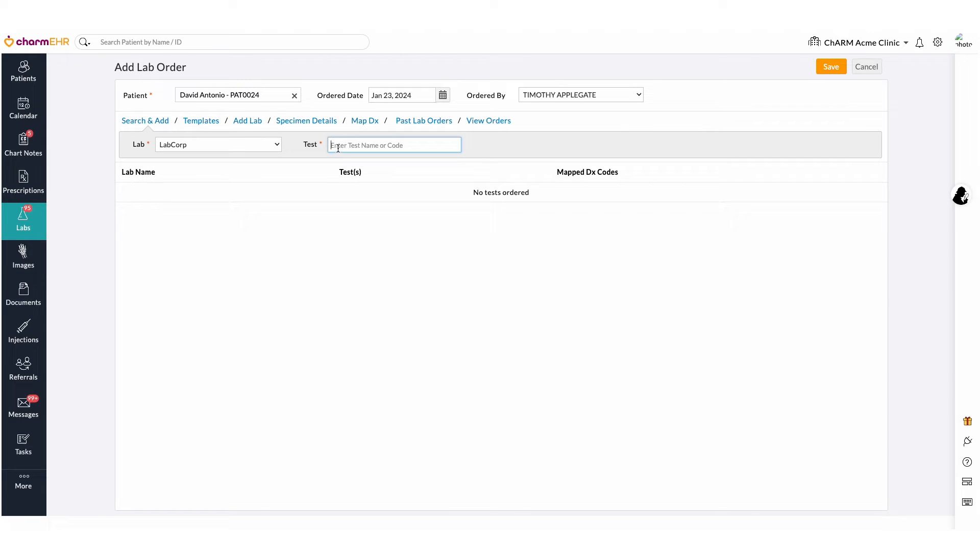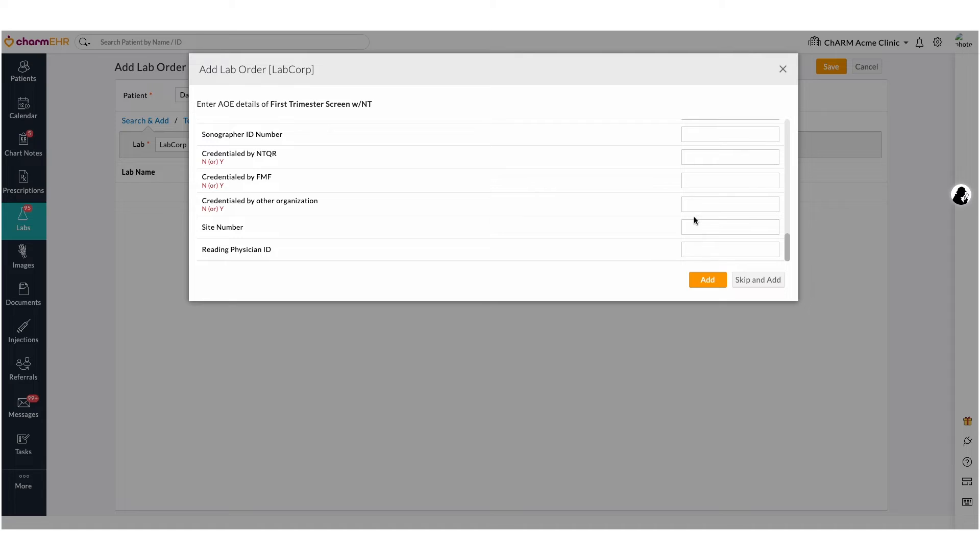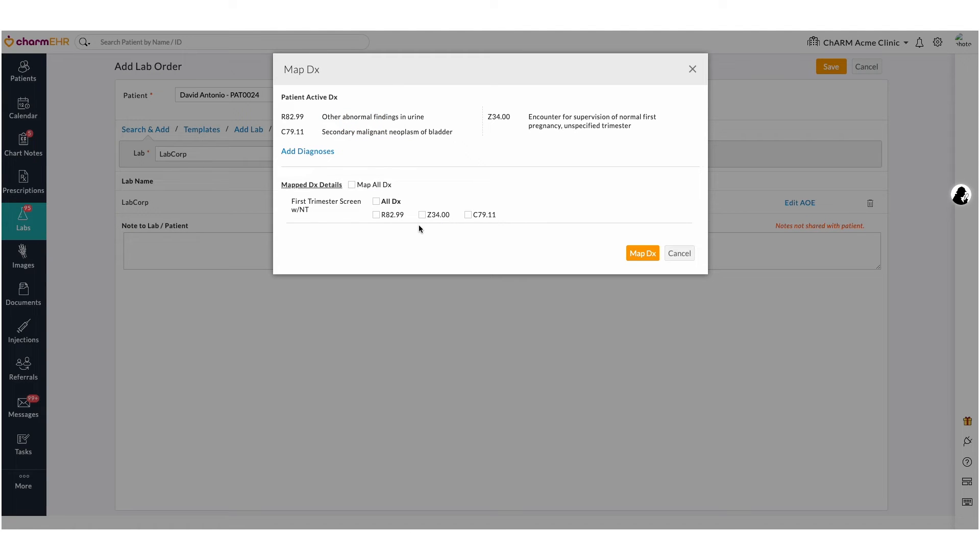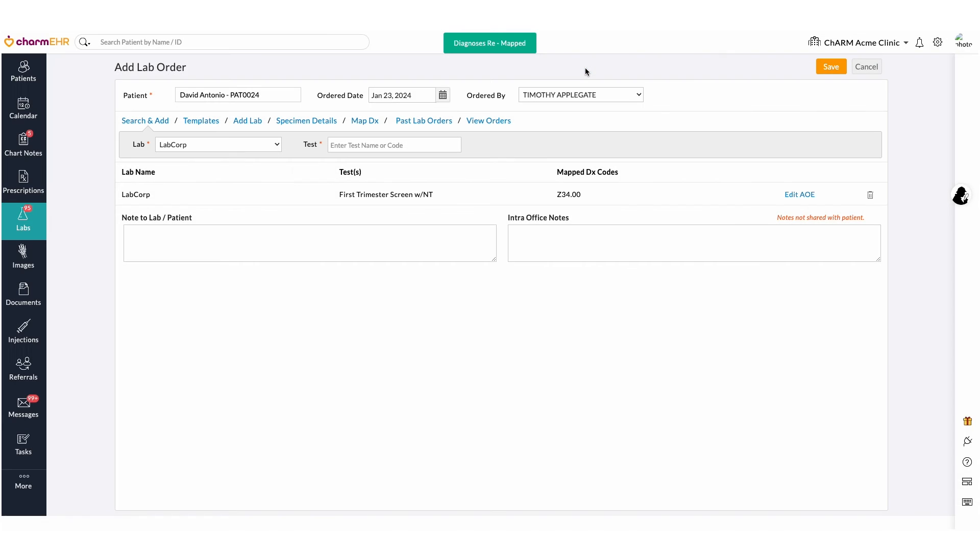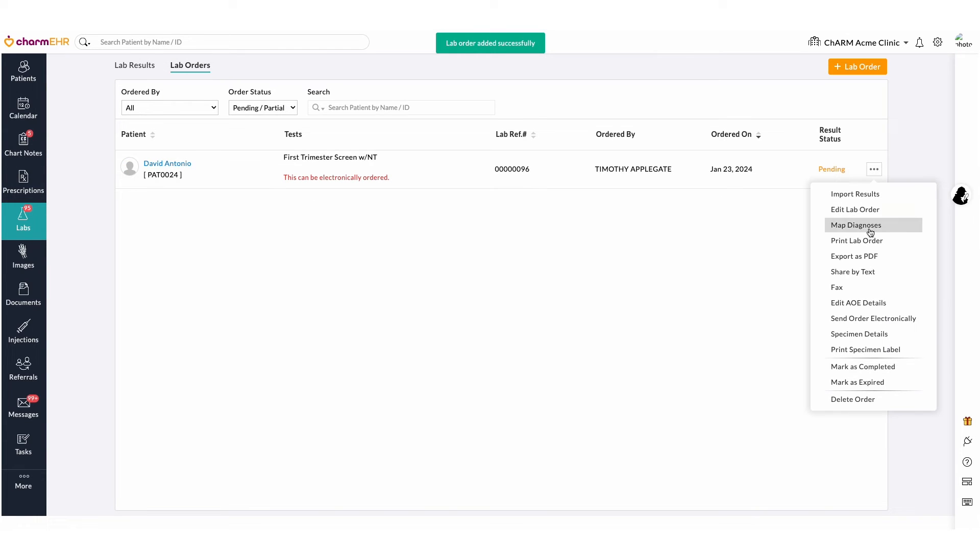Enter the AOE details if required. Map the DX to the corresponding tests and save the order. Click the Send Order Electronically action item.